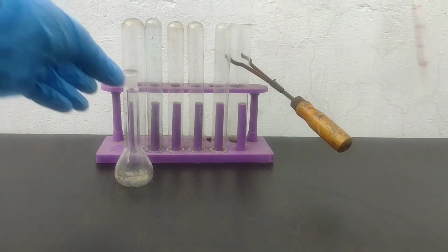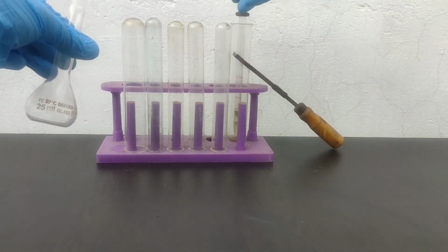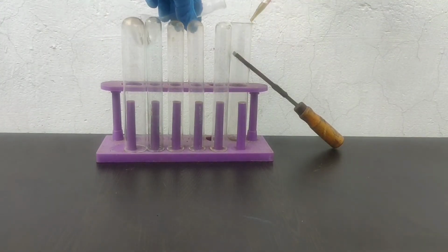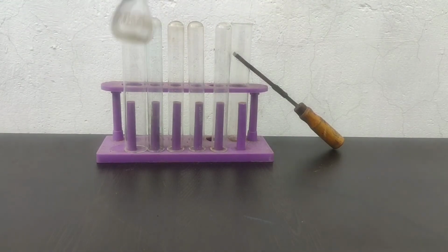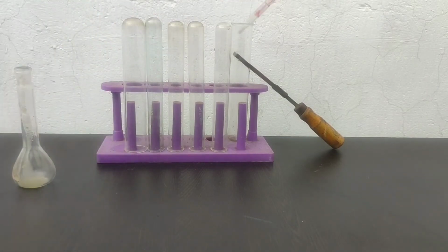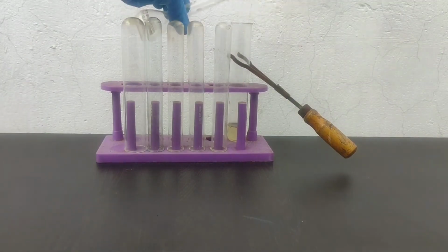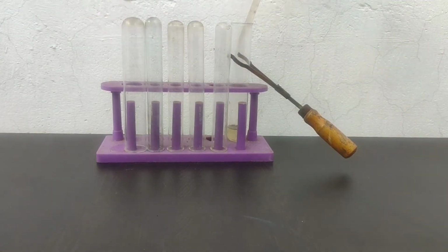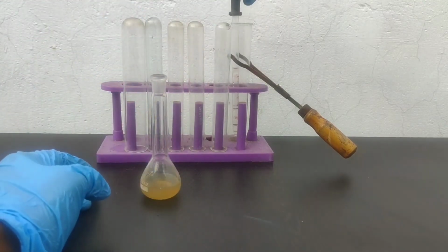So I pre-weighed the silver beforehand, so I know how many moles of silver nitrate are formed. The moles of silver I had produced equivalent moles of silver nitrate. So now I will adjust its volume so that I will be having a 0.25 normal silver nitrate solution. I washed the boiling tube and the dropper with distilled water and transferred all the washings into the volumetric flask. The solution is dirty. This is due to the dirt that came in my silver.